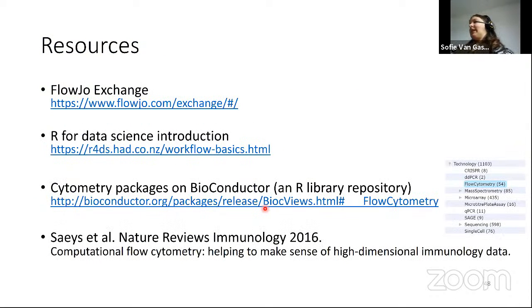Okay, and then I really get to the end. I think this will leave us some time for questions, so that's nice. I have a few resources that I just wanted to point out. If you're a FlowJo user and you're interested in these tools, have a look at FlowJo Exchange, in which they show a lot of different plugins they have available. If you're willing to make the jump to actually start programming, this is a very nice resource about getting started with R programming.